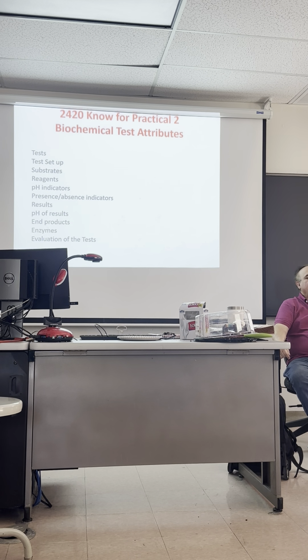Okay? The second thing you need to know is that if I ask you for a substrate, a lot of times if you know the name of the test, you know the substrate. What's the substrate in the nitrate reduction test? Nitrate. What's the substrate in the casein hydrolysis or the skim milk hydrolysis test? Casein. What is the substrate in the starch hydrolysis test?